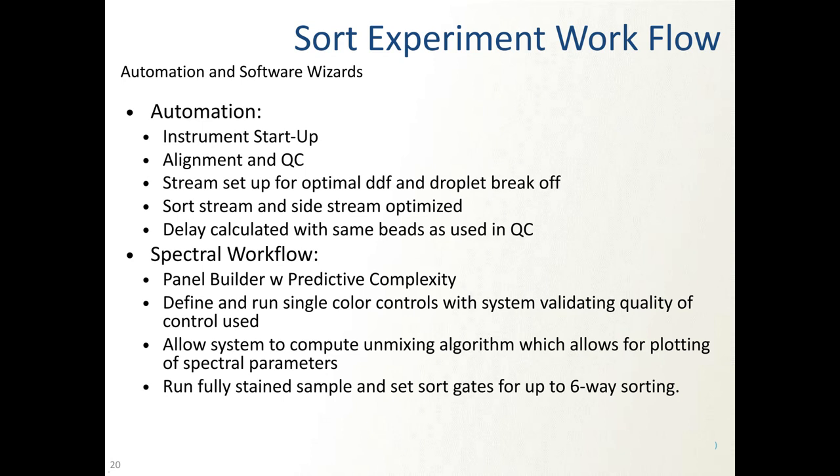I mean, you can do all kinds of cutesy experiments, but you actually need to be able to do stuff that benefits the researchers. Otherwise, it's impossible to get them to do it. Okay, so now I'm going to go through and talk about that sort workflow a little bit more.